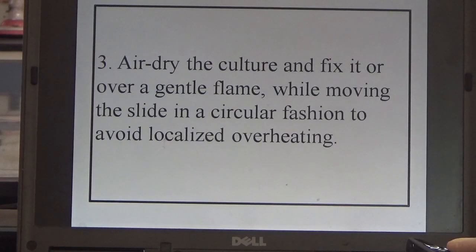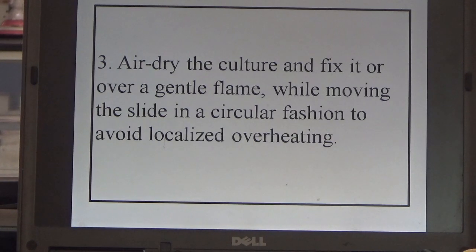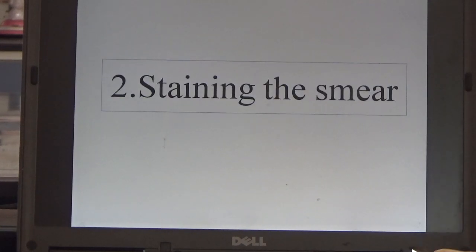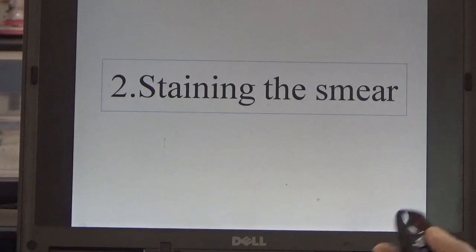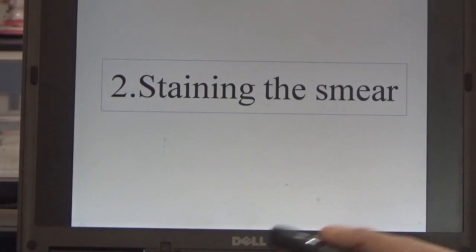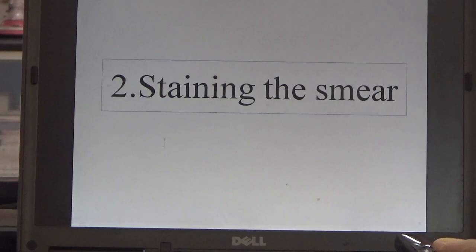Step 3: Air dry the culture and fix it over a gentle flame while moving the slide in a circular fashion to avoid localized overheating. Here we have already provided a pre-made smear. Then the second stage is staining the smear.